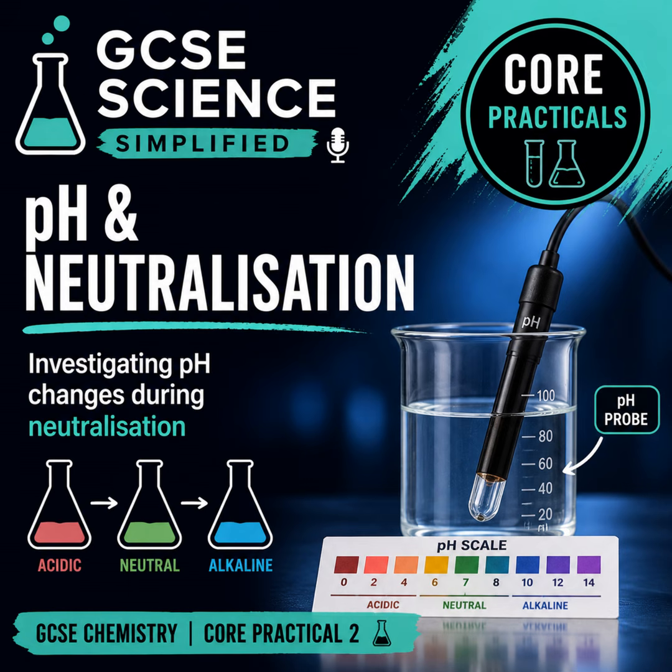This is where students either gain or lose marks. Why must you stir the mixture? Because the solid base needs to fully react with the acid. No stirring equals an uneven reaction equals unreliable results. Next up, what's the best way to measure the acid? We don't just bung it in a beaker, we use a measuring cylinder. Or even better, a pipette. Why? Well, it's a more precise volume, which means more reliable results. Additionally, we don't just put spatulas of our white powder in, we need to measure it using a balance.